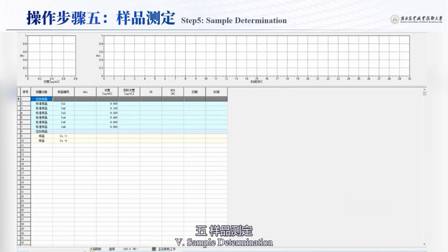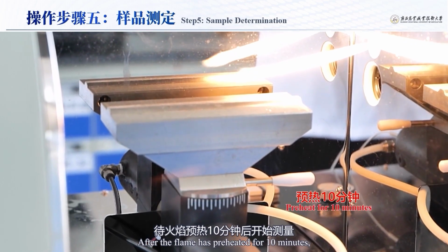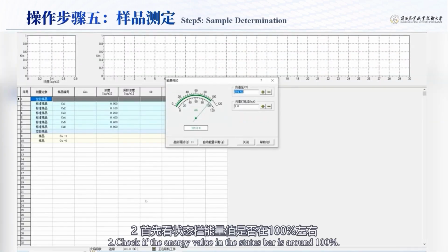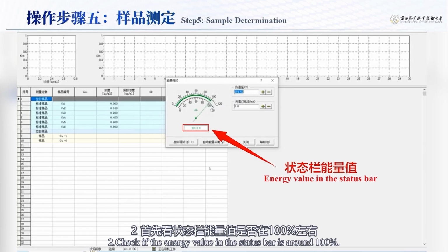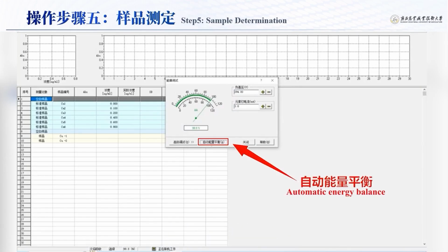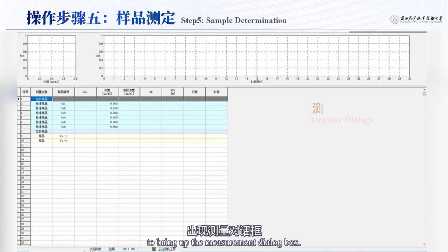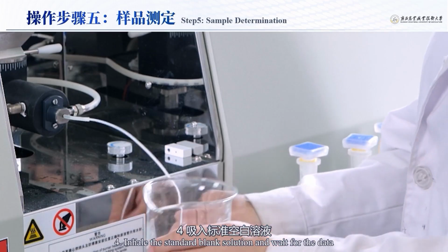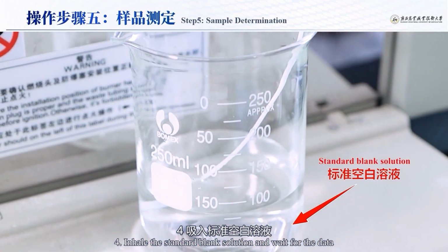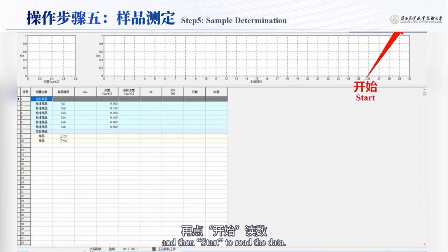Fifth, sample determination. First, click the ignition button on the toolbar. After the flame has preheated for 10 minutes, start the measurement. Second, check if the energy value in the status bar is around 100%. If not, click Energy and then Automatic Energy Balance. Third, click the Measure button on the toolbar to bring up the measurement dialog box. Fourth, inhale the standard blank solution and wait for the data to stabilize. Click Zero Calibration and then start to read the data.